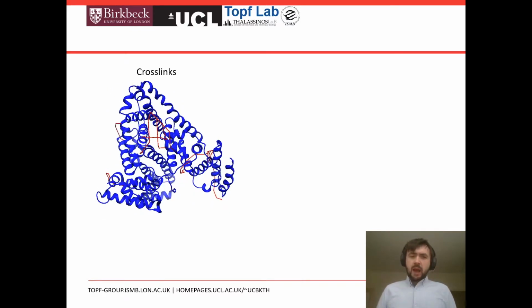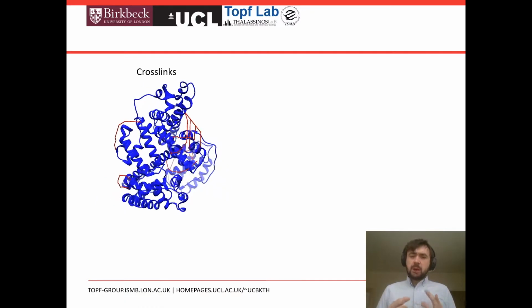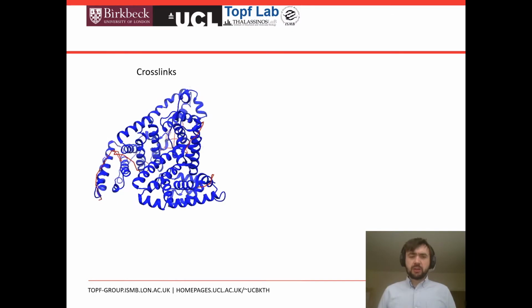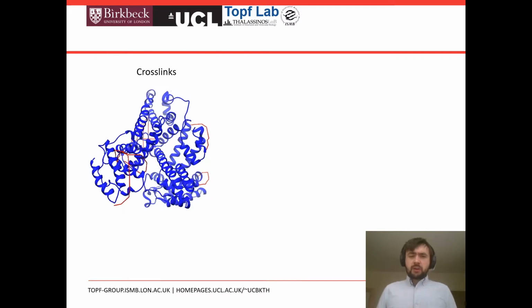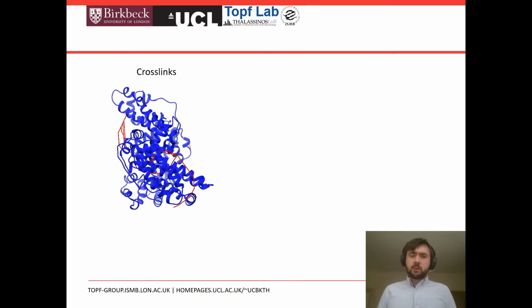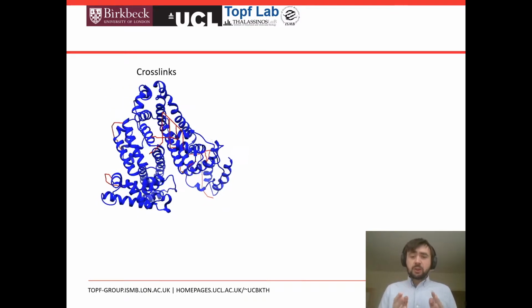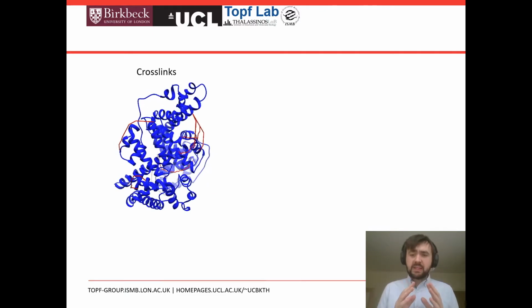as residues. And these residues fold into different conformations which form big 3D structures. So with chemical crosslinking, what we can investigate is which residues are, first of all, on the protein surface, and two, which residues are close together in space.